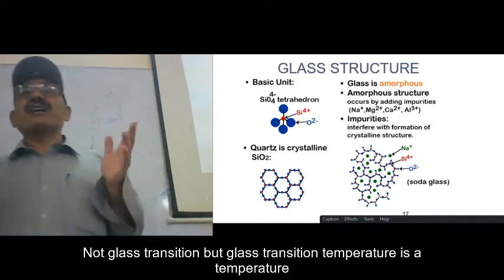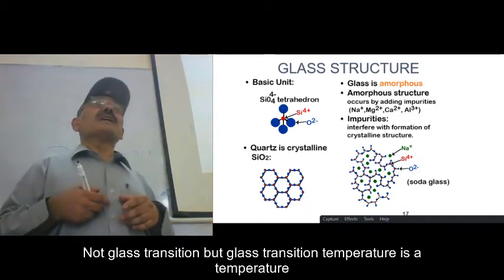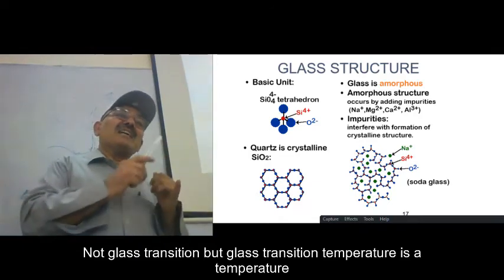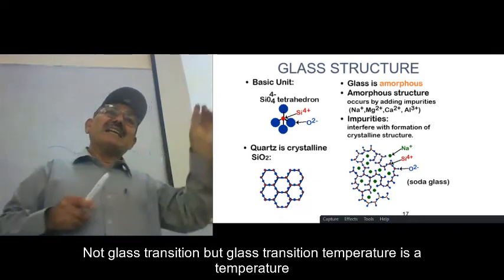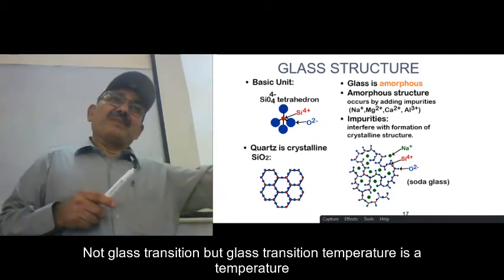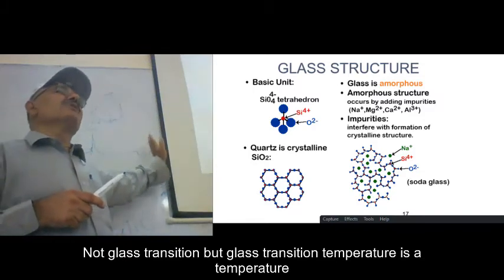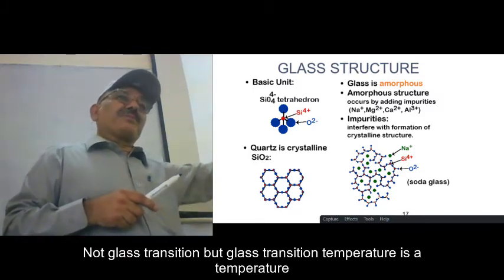When you have the batch composition, then if you are careful, do the DTA of the mixture. Do the DTA of the mixture, it will give you the overall picture.